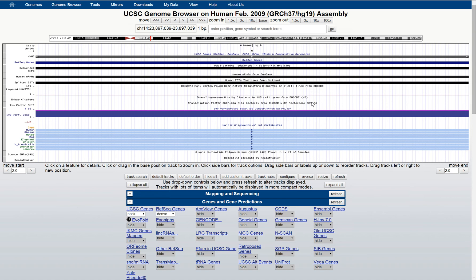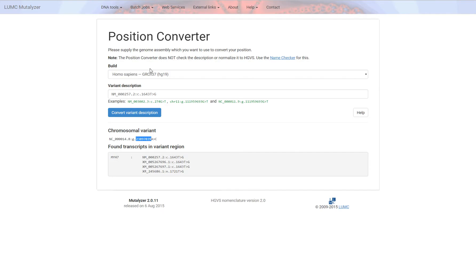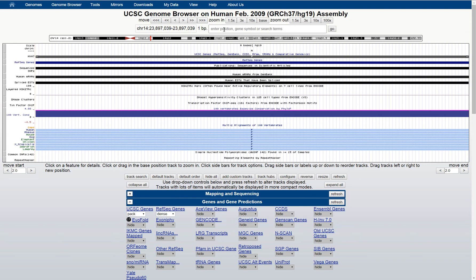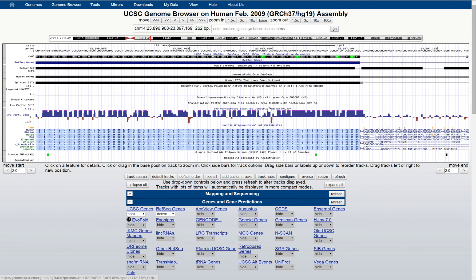After you've searched for the specific variant location, one thing to mention is making sure your genome build matches up. In this case, the same build used to create this genomic coordinate is also used in UCSC. After searching, you can click the base button and you will get the neighboring amino acids in this sequence.